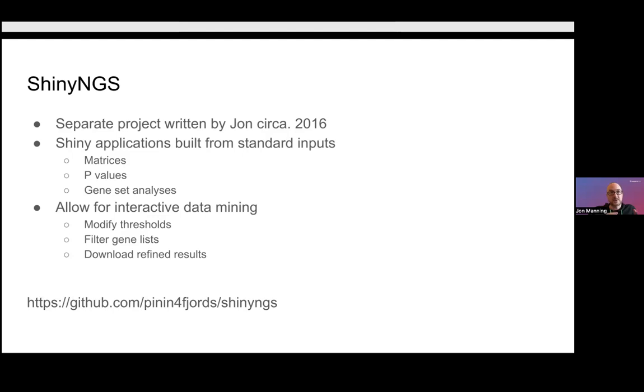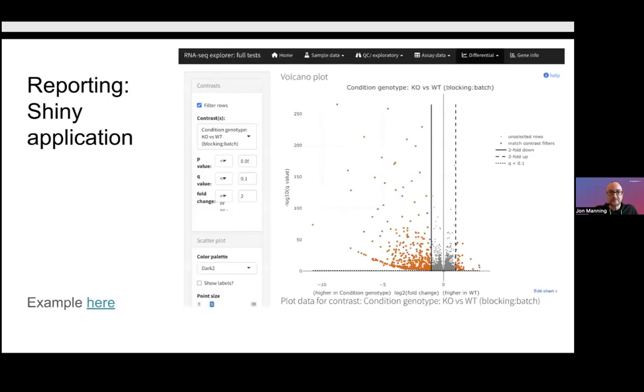I should say that ShinyNGS is an independent product and it's quite powerful. I haven't wired every feature of it into the workflow yet, so the things you get from the nf-core differential abundance workflow, not all that connects into ShinyNGS yet, but it is to a large extent there and you can do some quite powerful data mining with it. And you get plots like this. So this is a volcano plot which, if I was showing you it live, you'd be able to mouse over these points and find out what genes these are. And you can adjust these thresholds to move these boundaries around in the plot, for example, to show different sets of genes. And you can change the color palettes and point sizes and do all that cool stuff as well. That's powered by Plotly, and you can export those plots from this interface.